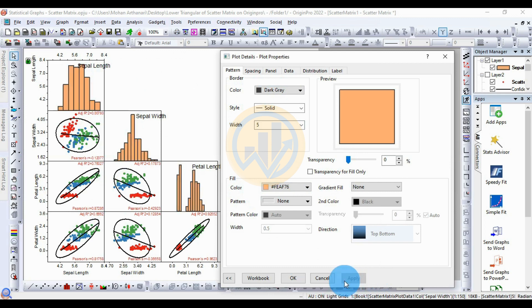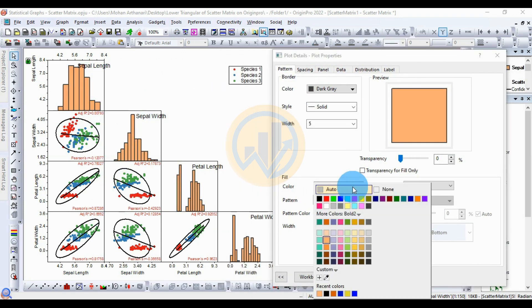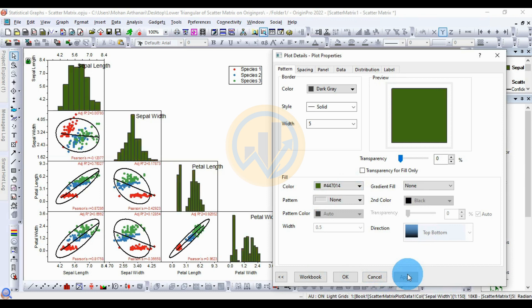Click Apply to change the histogram color. If you prefer a dark color, select the dark color option, click Apply, and then click OK to confirm the dark color.